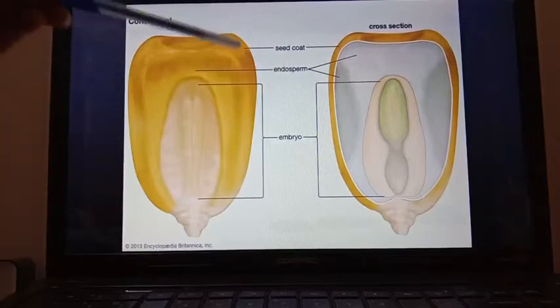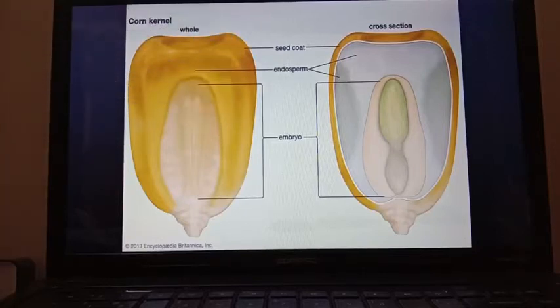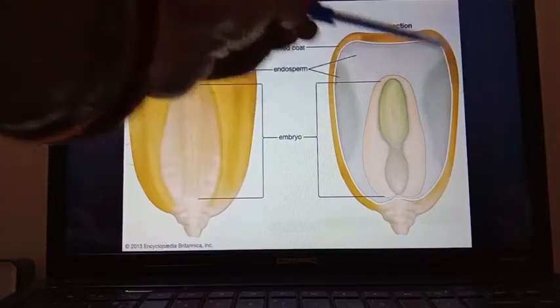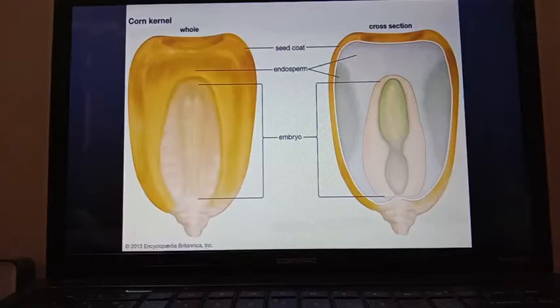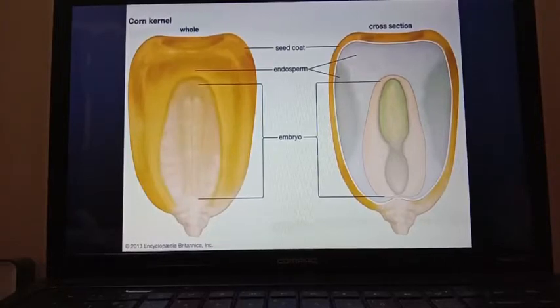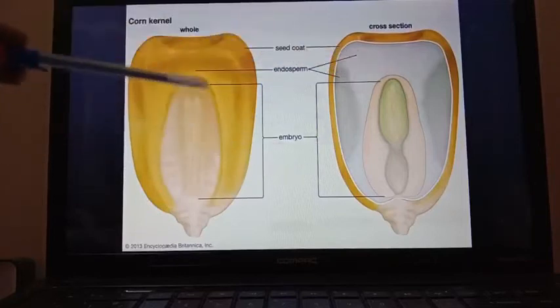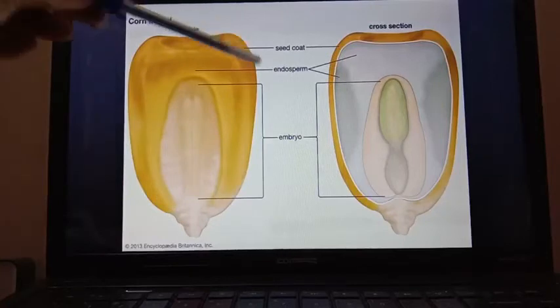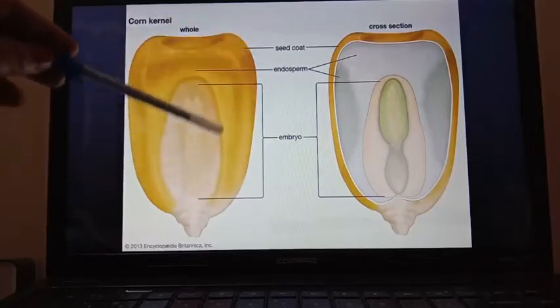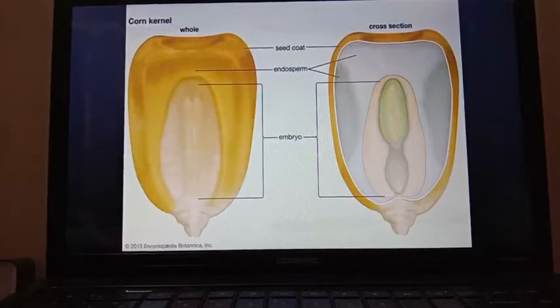One part is dark yellow in color and another is whitish-yellow in color. The broader part is yellowish in color and mainly contains endosperm. The yellowish broader part is the main endospermic region. The whitish conical-shaped part mainly contains the embryo. So the yellowish broader part contains endosperm and the whitish part contains the embryo.